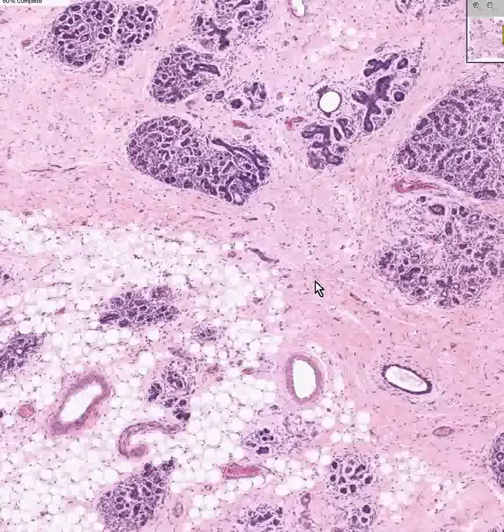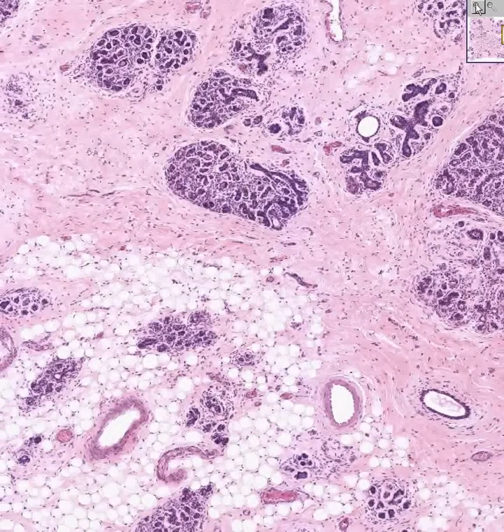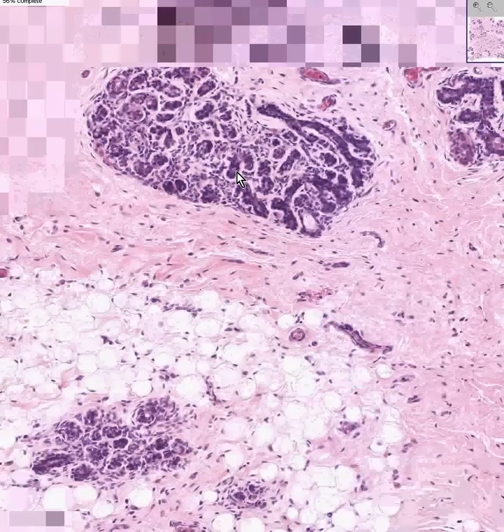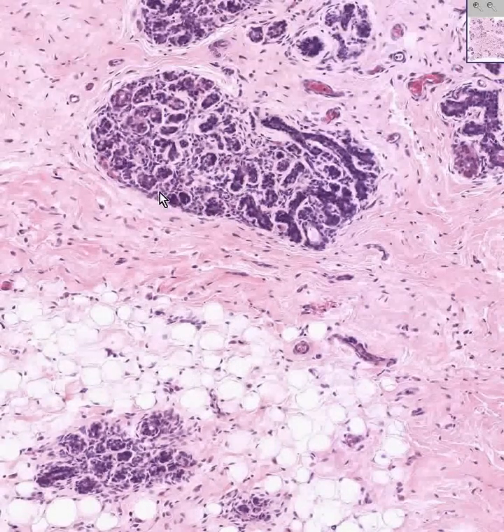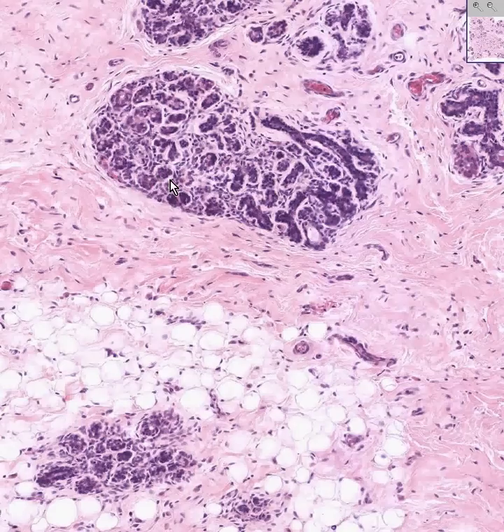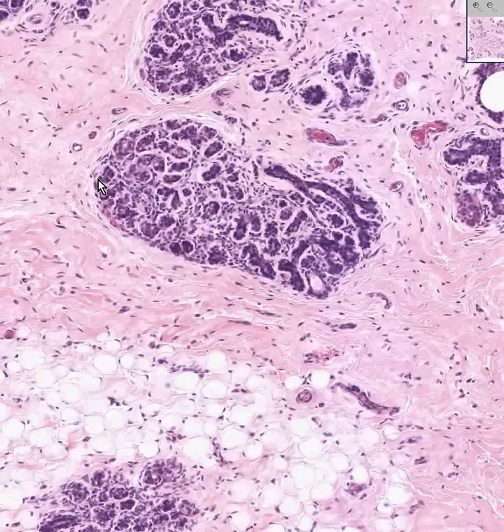At the next lower level, lower than the lobule, you have these individual structures here — and these are the actual acini, sometimes called alveoli. Each acinus is separated by a small amount of connective tissue from other acini. Otherwise, this whole thing is a lobule.